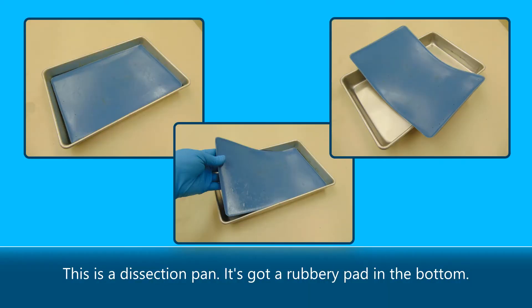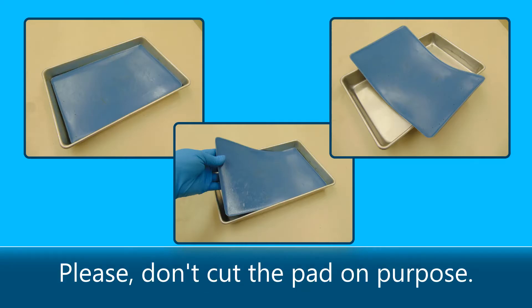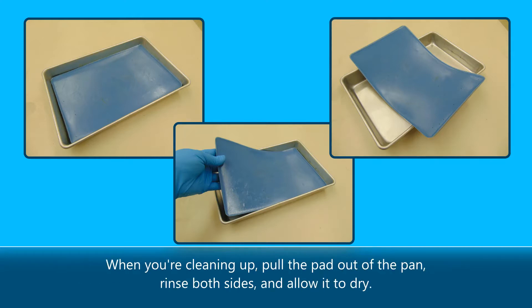This is a dissection pan. It's got a rubbery pad in the bottom. The pad is a flexible surface for pinning specimen parts to, and it helps to prevent breaking scalpel blades. Please don't cut the pad on purpose. When you're cleaning up, pull the pad out of the pan, rinse both sides, and allow it to dry.